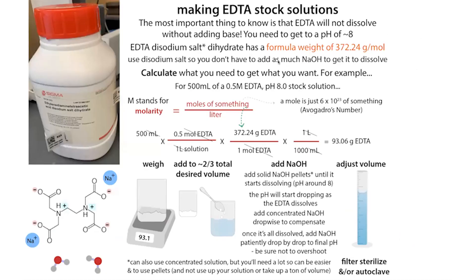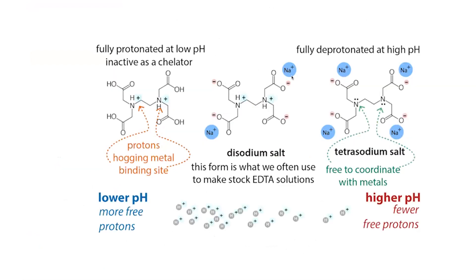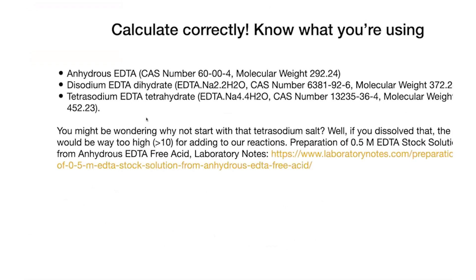Once you know the weight — for disodium EDTA dihydrate, that's 372.24 — you can do your calculations and weigh it out. There's also something called tetrasodium EDTA tetrahydrate, where the nitrogens get deprotonated at a very high pH and hang out with four sodiums, but we typically don't use this because the pH would be way too high. Each of these forms has a different formula weight: the anhydrous form is 292.24, the disodium dihydrate is 372.24, and the tetrasodium form is 452.23.